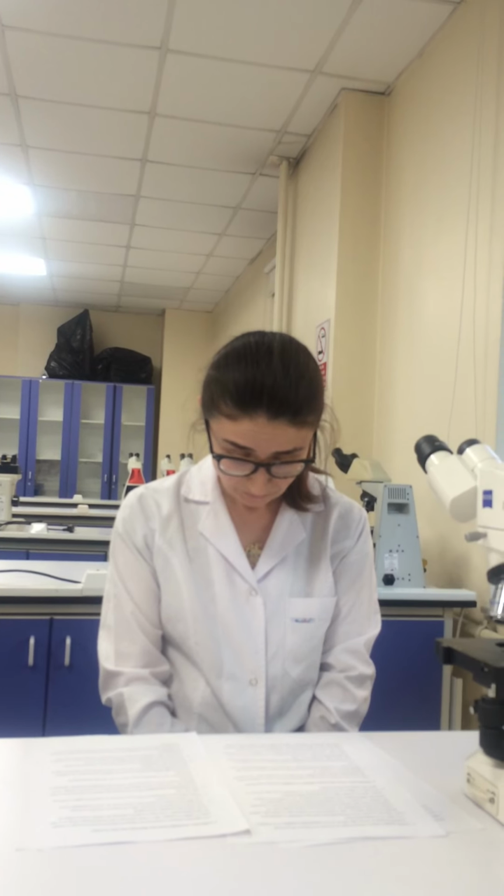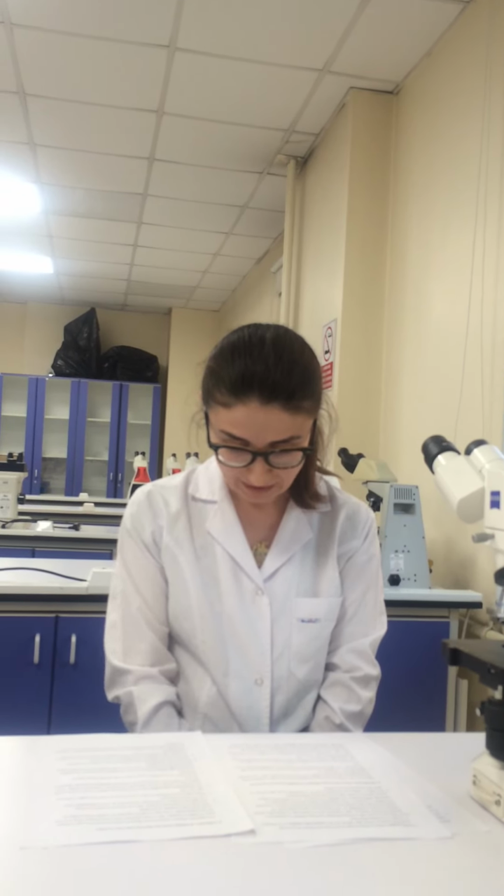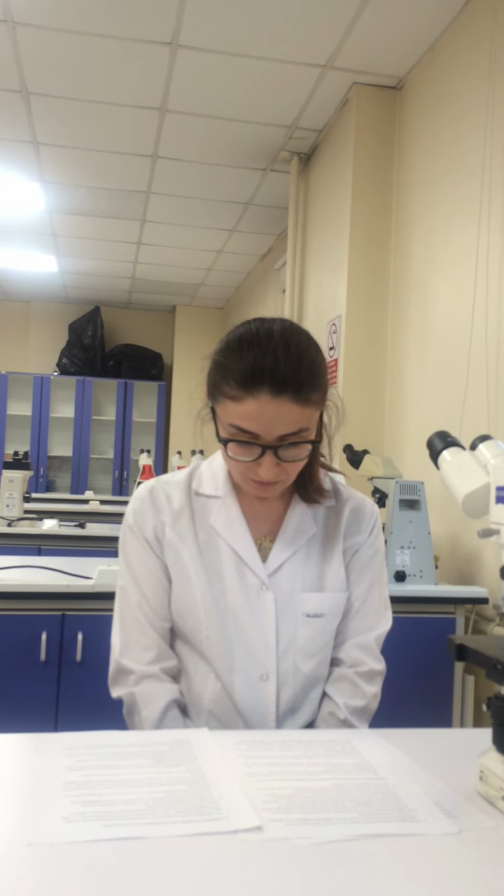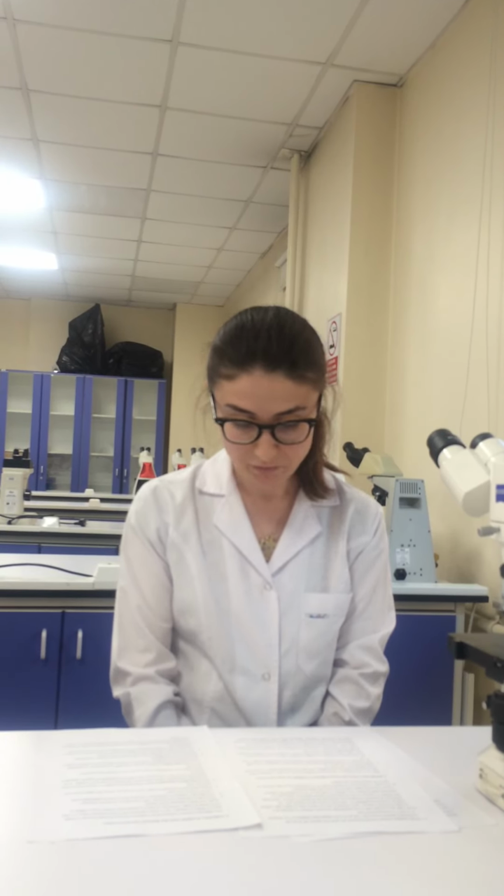These stem cells are suspended, counted, and adjusted to 10 to the 6 cells per milliliter in ice cold FCS wash buffer.